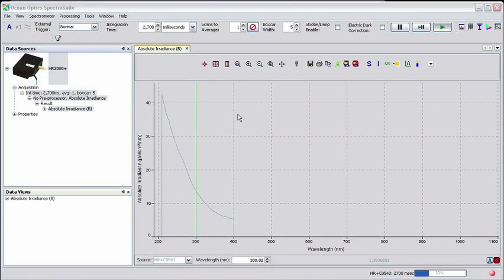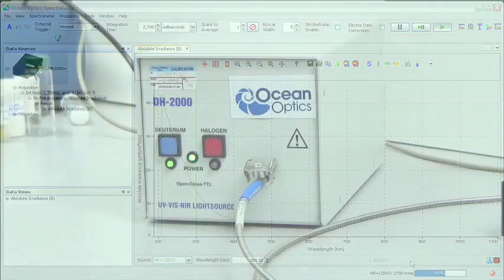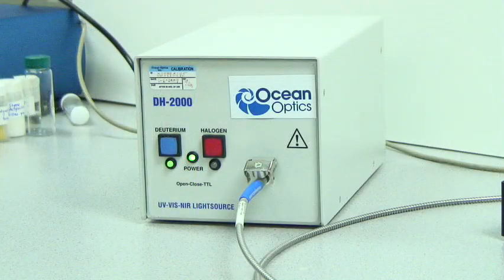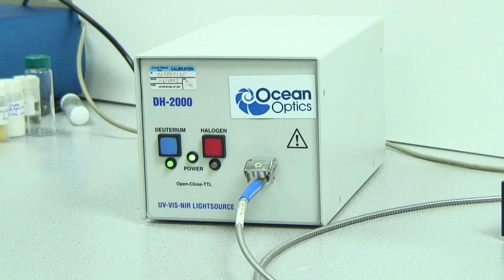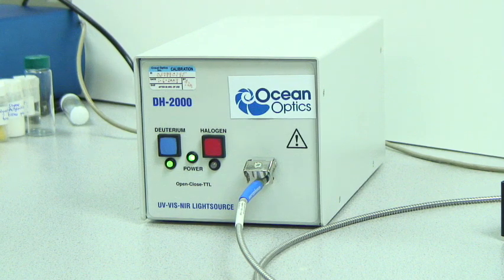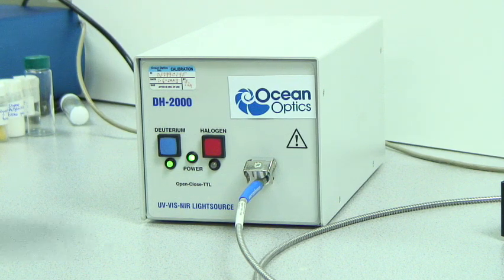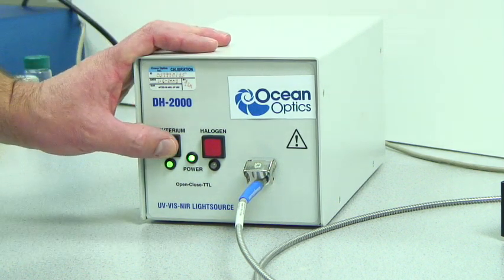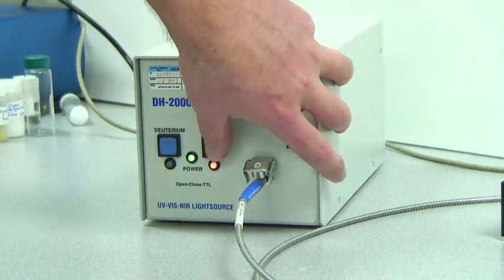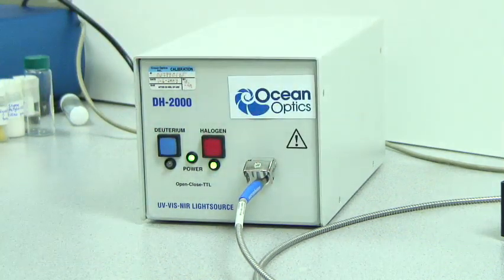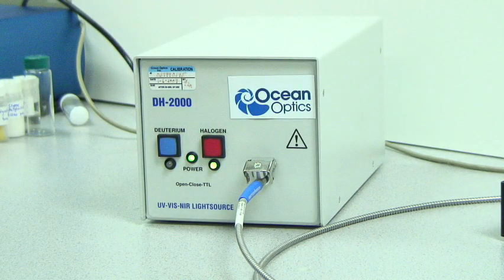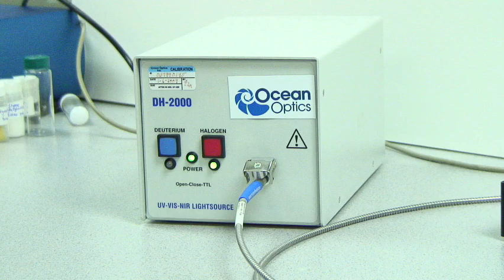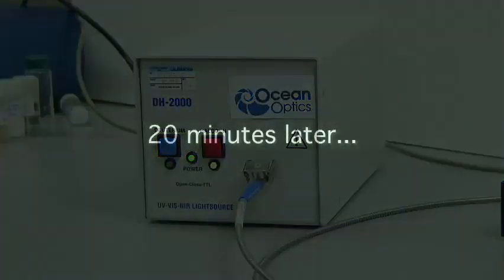Next, we'll perform the VIS calibration using the halogen bulb of the light source. Turn off the deuterium bulb by pressing the blue button on the front panel. Now press the red button on the front panel to activate the halogen bulb. Remember to allow at least 20 minutes before performing your calibration.